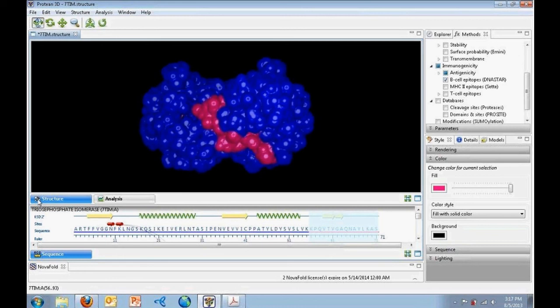This particular bioinformatics approach uses experimental antibody recognition data. And so for a set of Neoclone peptides, the antigenicity of each peptide was determined by measuring the binding affinity of that peptide against various hybridoma-secreted antibodies in mice inoculated with that particular peptide. Now, highly antigenic regions are those in which at least 5% of these hybridoma cultures create antibodies that tightly bind the peptide. And the antigenic regions are regions in which at least 2.5% of which do so.